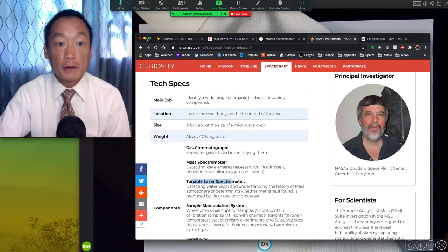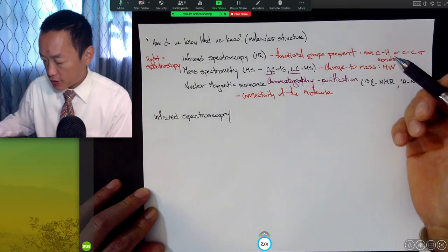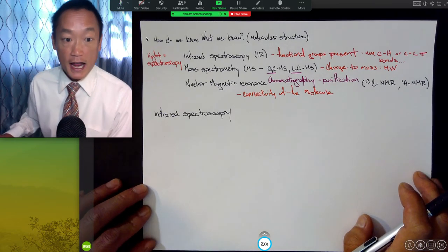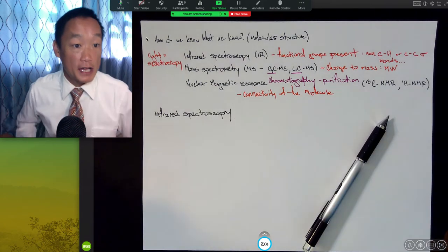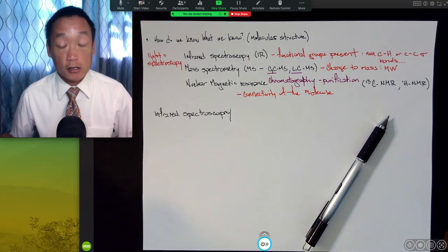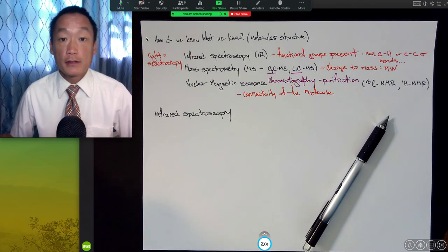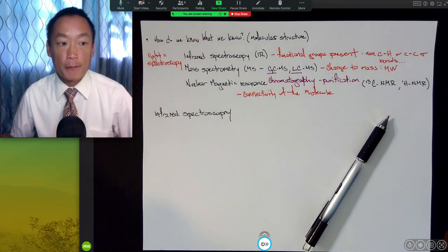Let's talk a little bit more about how IR works. Infrared spectroscopy uses the wavelength of light that is at that region in a molecule where the bonds are. Every bond in a molecule has its own energy. And what type of theory did you learn that talks about the energy that a molecule has? Molecular orbital theory is the only theory that you know that contains information about the energy of a molecule.